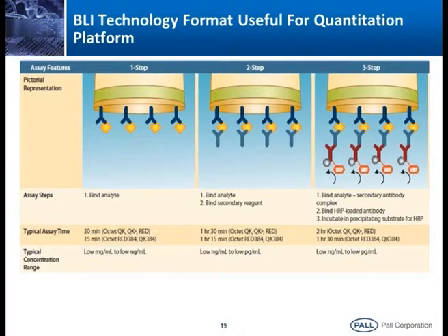So suppose your protein expression is at the nanogram or picogram level. At that time we require a secondary antibody to amplify the signal. In your ELISA, you people use a secondary antibody, right? Similarly, we can use a secondary antibody here to amplify the signal. Here the concentration we can go from low nanogram per ml to low picogram per ml. So suppose I want to replace the complete ELISA onto this instrument, yes, it is possible. As in the principle I said, the more the optical thickness, the better the amplification. If you see, so many things are here, we can amplify the signal.